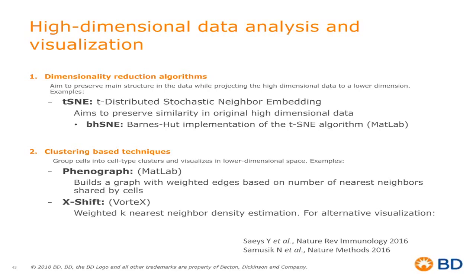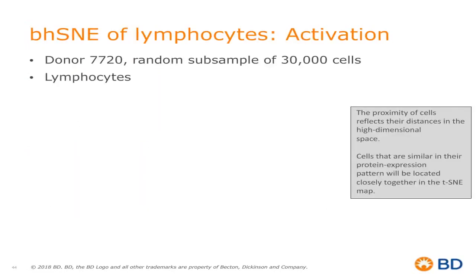And these are just, again, different ways to visualize your data and basically try to understand and reveal some of the heterogeneity within the T regulatory subset that we were analyzing, that we were maybe just interested in looking at some homing and activation markers, but actually turn out to be quite heterogeneous.